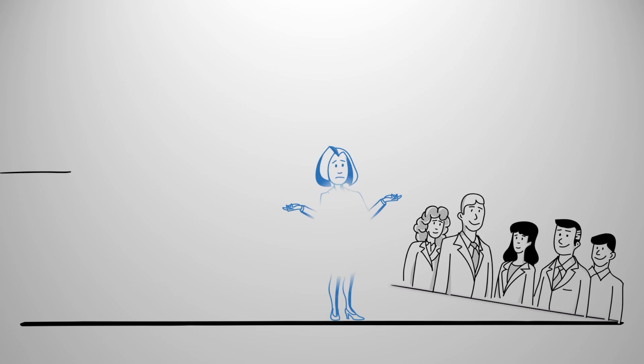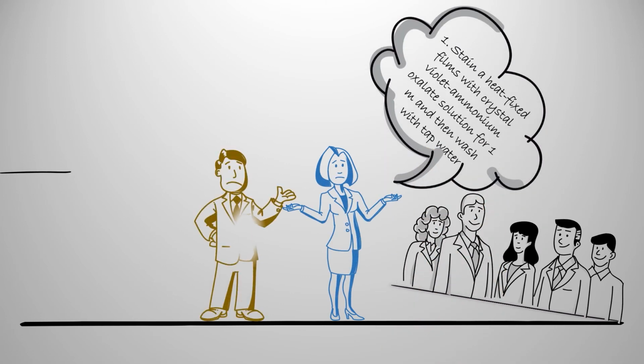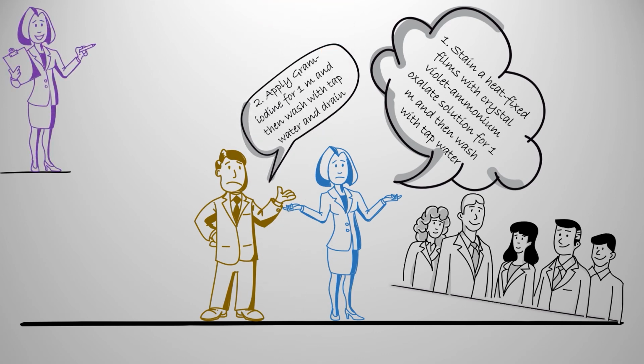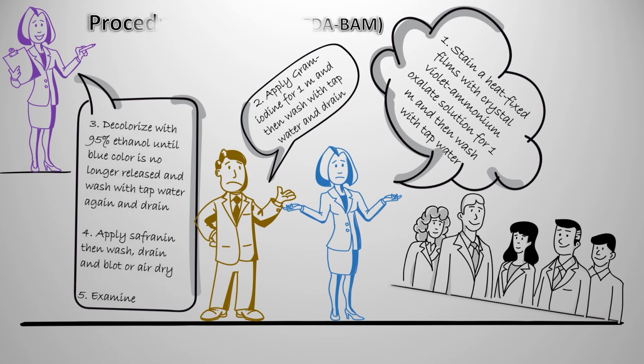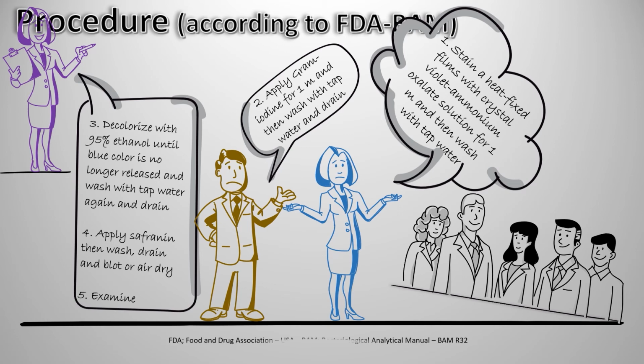The procedure is very easy, based on the FDA and their big manual, the Bacteriological Analytical Manual.